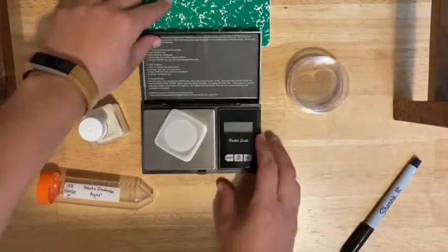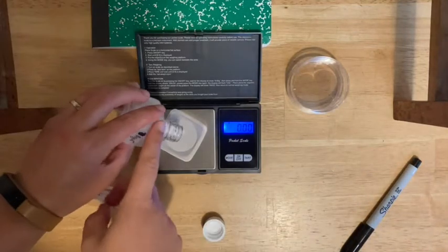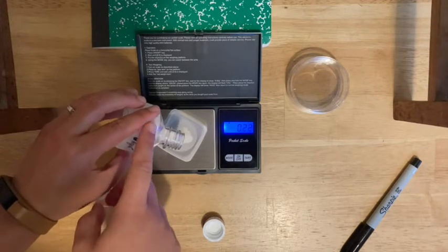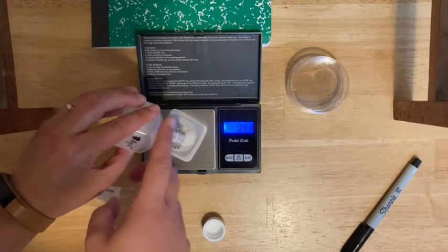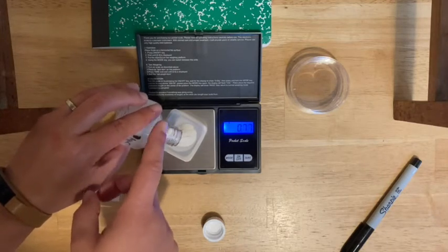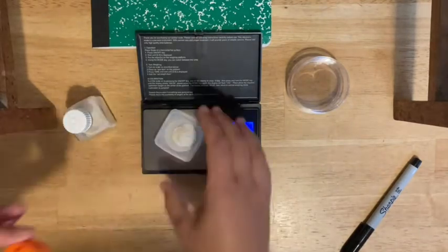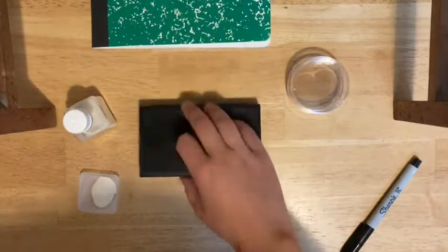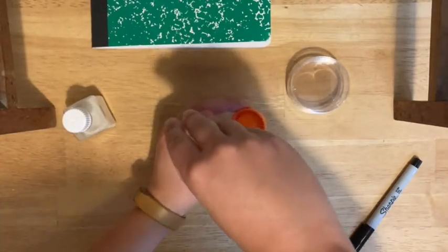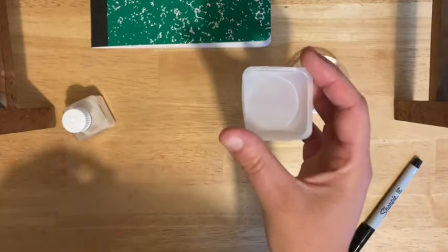You're ready to go ahead and weigh out the potato dextrose agar. Put the weigh boat on the balance and make sure you zero it with the weigh boat on there. Carefully measure out the potato dextrose agar — go slowly and try to get the exact amount. If you go a little bit over, you can use a clean spoon to scoop out the extra. Try to be as precise as you can. When done, turn off the balance, move the weigh boat aside, and tap all of the material into the tube — try to be careful not to spill. You can wash the weigh boat and reuse it.